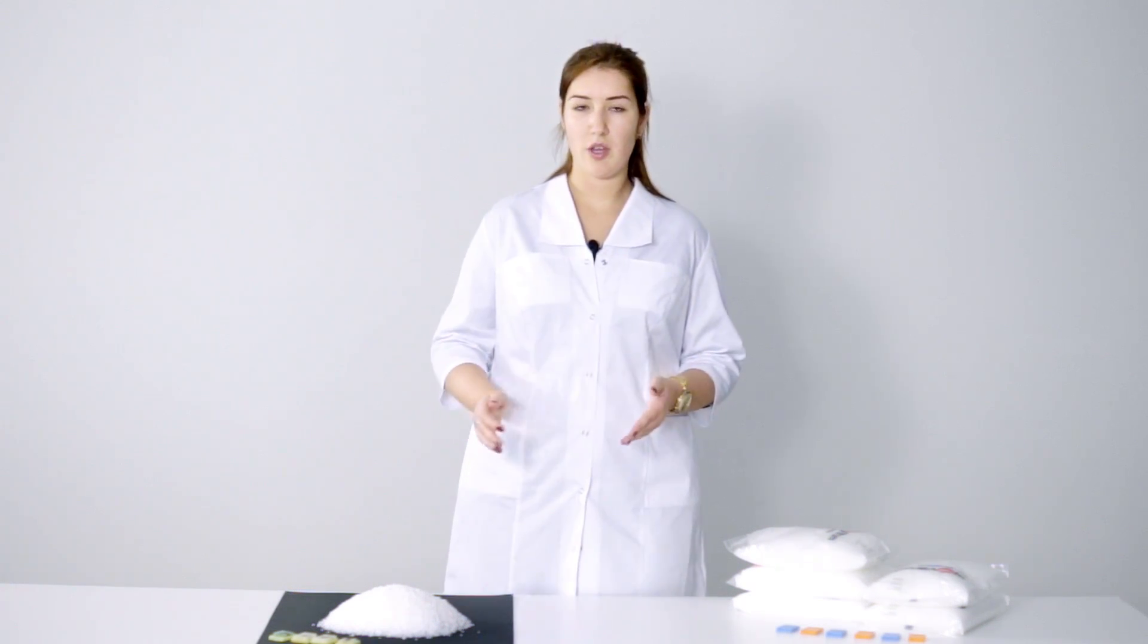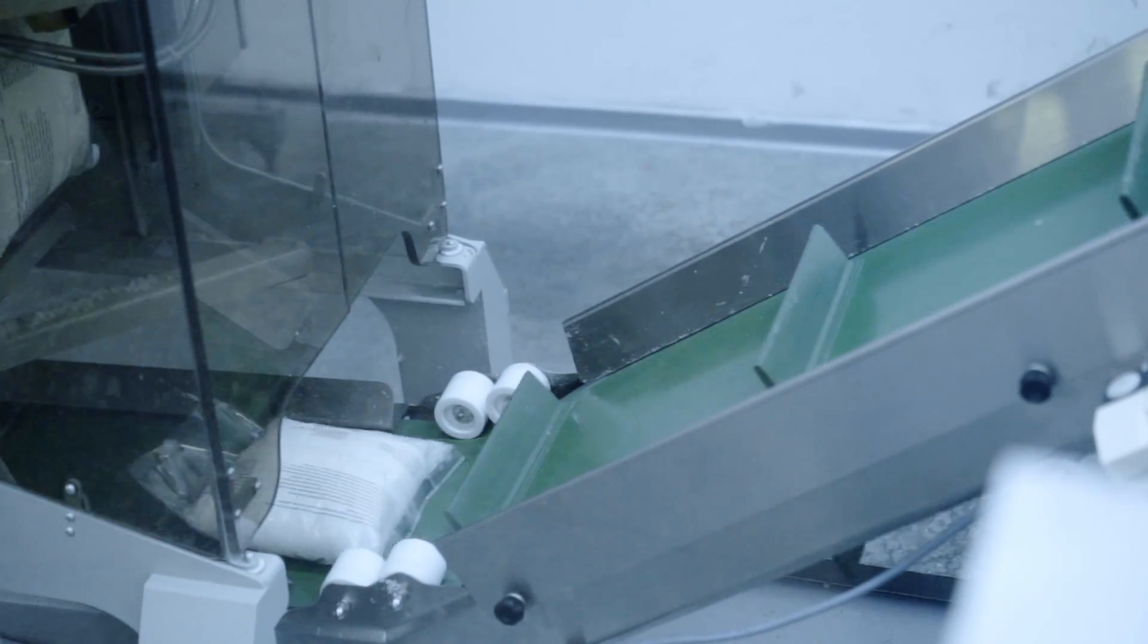Nowadays, there is a wide variety of ready-to-use embedding mediums from different manufacturers. First of all, manufacturers carry out quality control of incoming raw materials. They have certified recipes for their embedding mediums so they know for sure what amount of which additive to use.